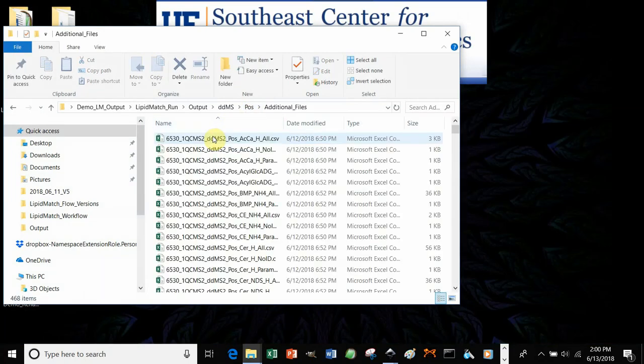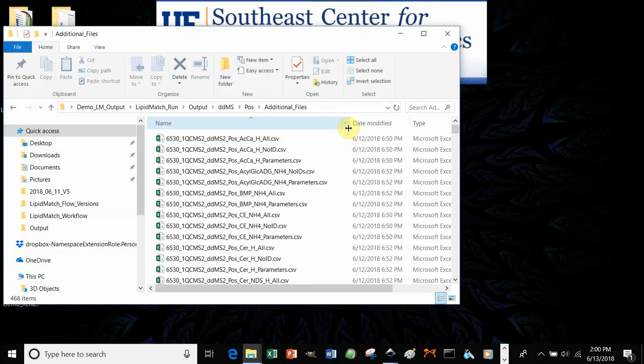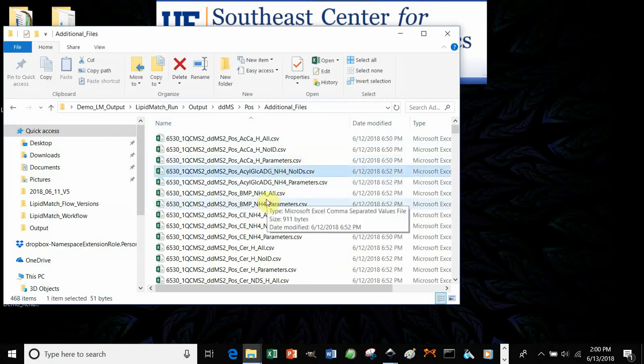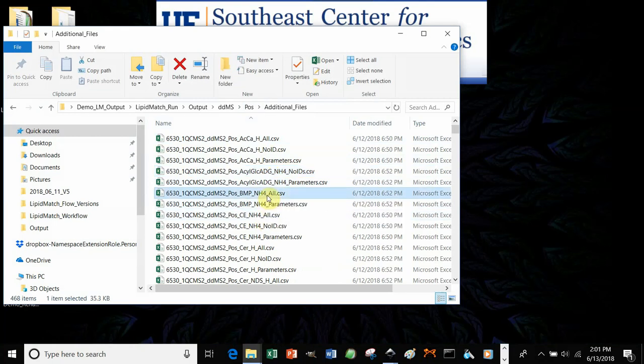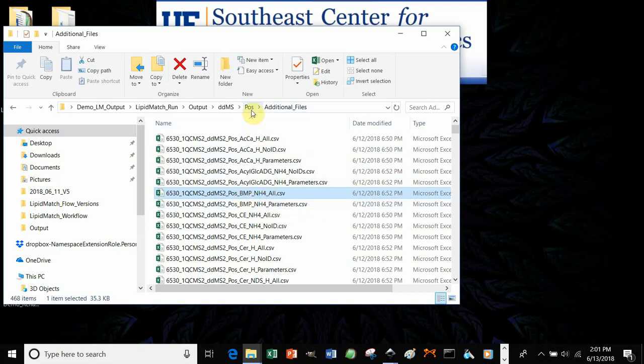In additional files, you can see the parameters that were used, the mass accuracy, etc. You can also see, if you go to all, for example, all of the BMPs that were identified by exact mass, even the ones that weren't identified, and what fragments were observed. In case there's one you expected, but you missed something.